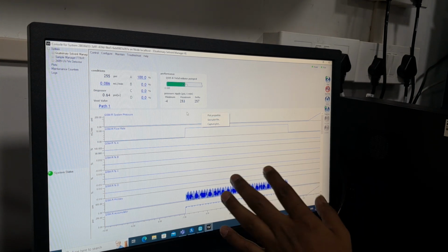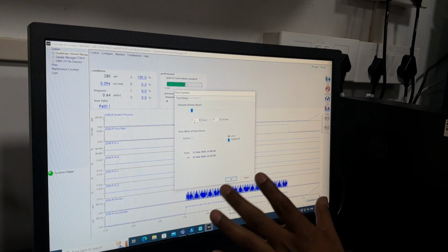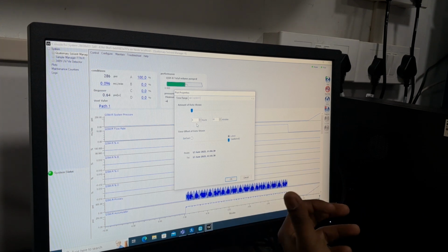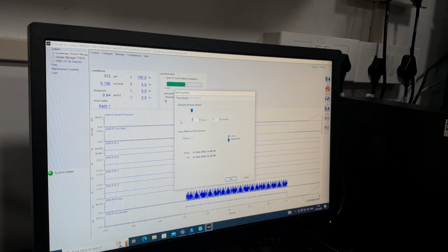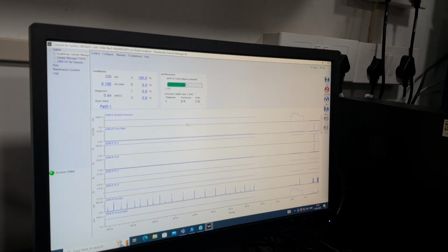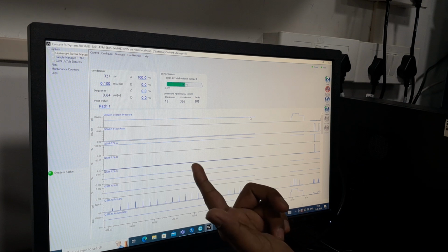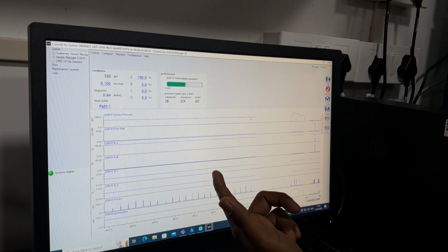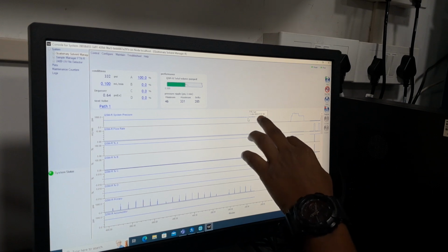So I'll just click on the plot properties. Now, say you want to check whether the instrument pressure has been affected for the past 2 hours, the past 10 hours, or something else. We can give it 10 hours. I will just give the time. Yesterday overnight it was loading on the 0.2 flow, at around 600 psi or something. So we click here. So 13.6, yeah, 7 AM. That time it was 500 psi.